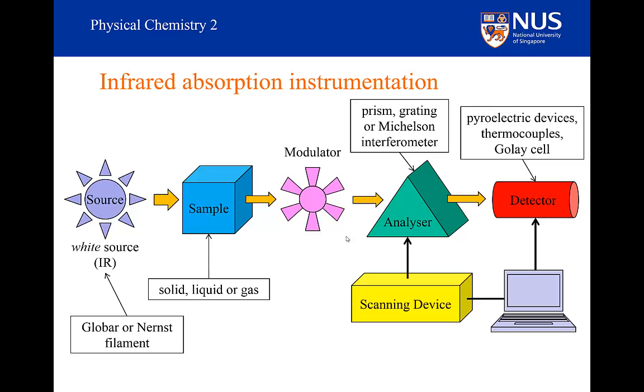We do have a further problem working in the infrared, which we don't have when putting together a spectrometer working in the visible region. All the optical components in a visible spectrometer can be made out of glass, but glass is not transparent in the infrared.